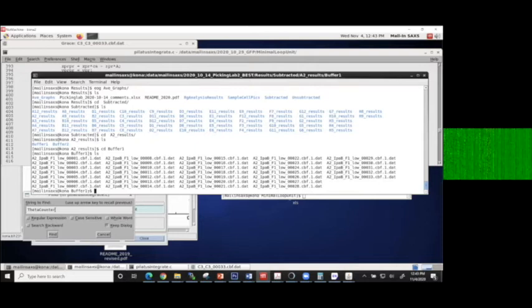And there are 33 frames here. And those 33 frames are generated because we expose the whole sample for a full 10 seconds, but the camera that's capturing the data is framing that data at 0.3 second intervals. So that's a way to determine when radiation damage is occurring.